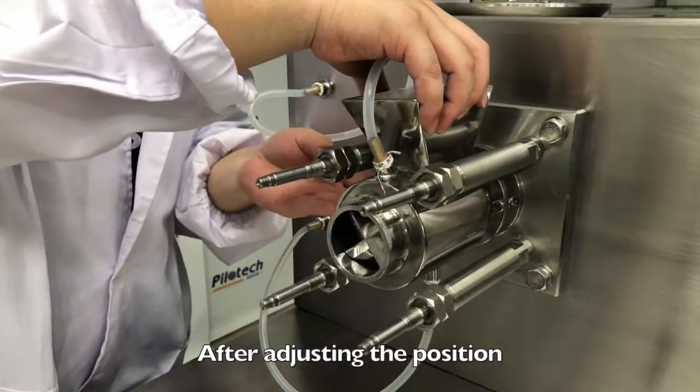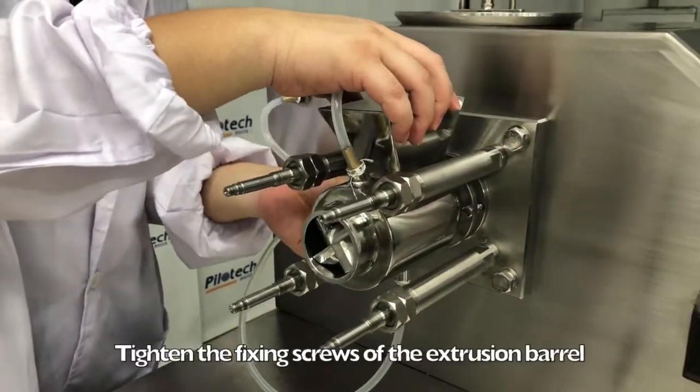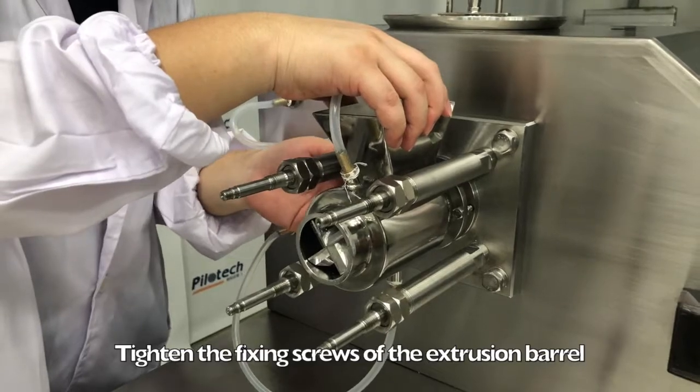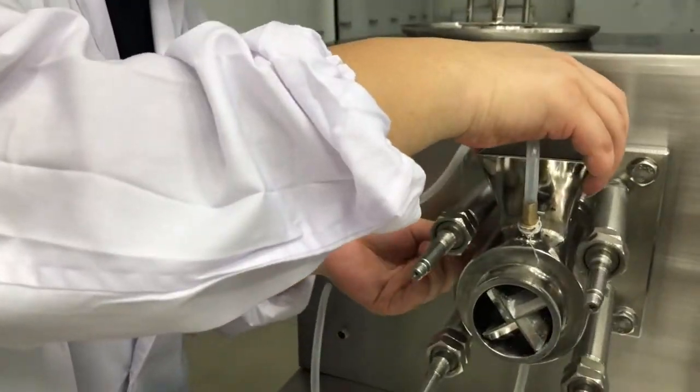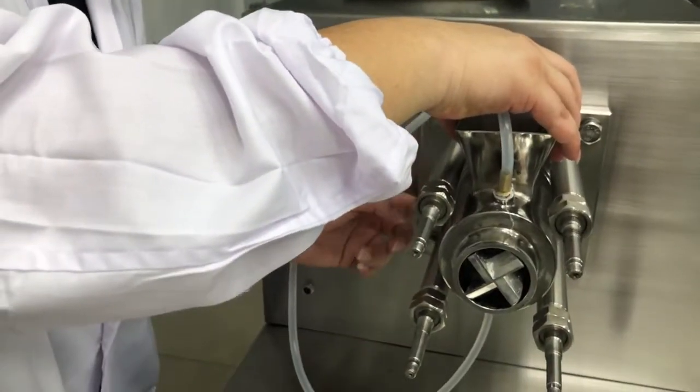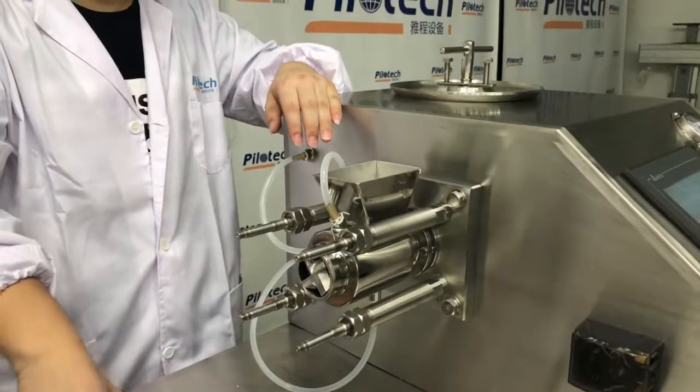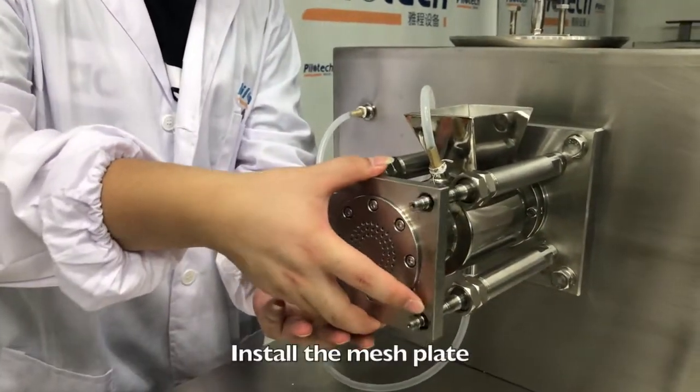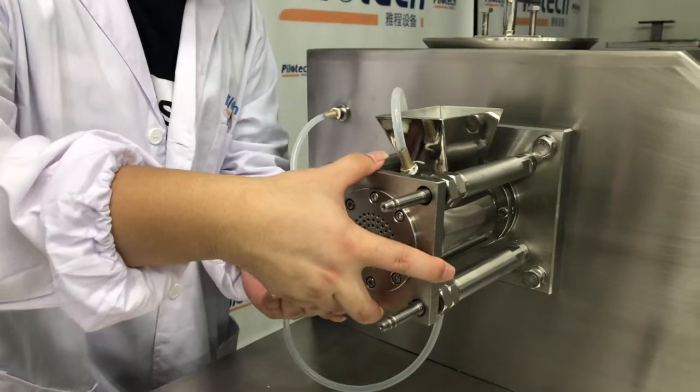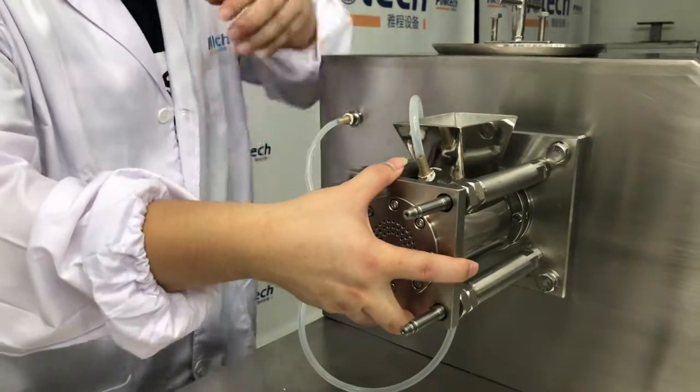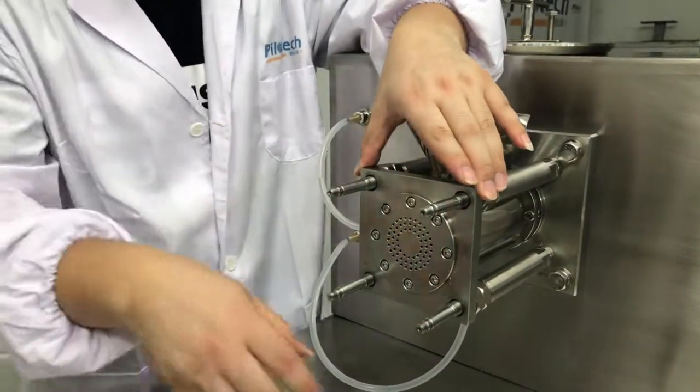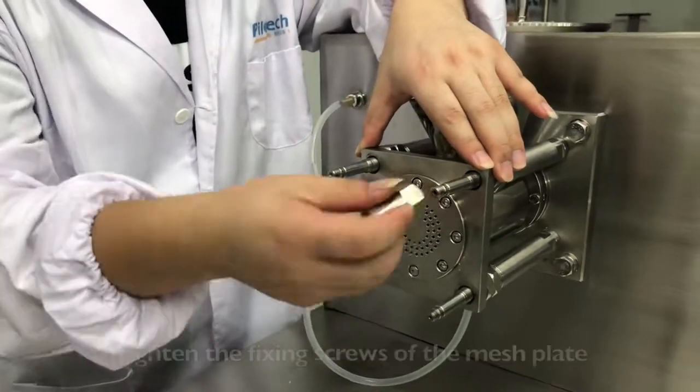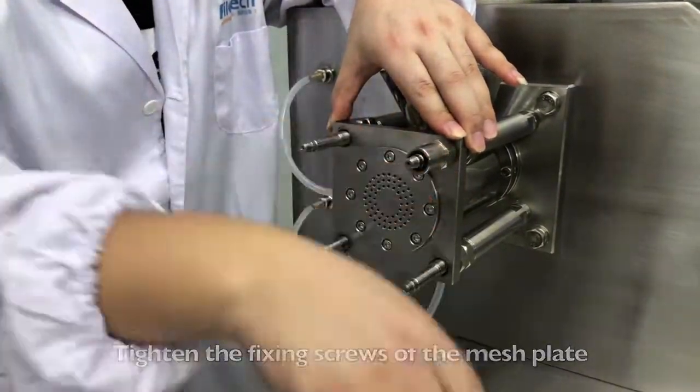After adjusting the position, tighten the fixing screws of the extrusion barrel. Install the mesh plate. Tighten the fixing screws of the mesh plate.